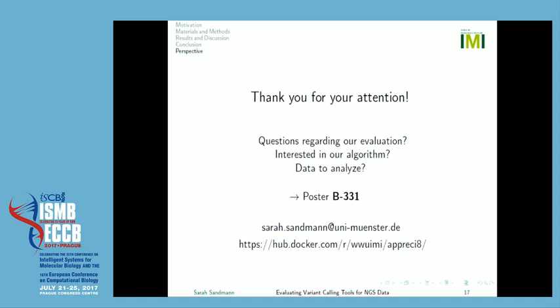Did you observe that? Did that make a difference? Actually, for the tools, we mainly stick to the default options because for all the tools there's such a large list of options, and you could just not change everything to observe all the differences. So we mainly stick to the default options and just to what they recommended to achieve the best sensitivity. We only lowered the allelic frequency threshold and just made it as sensitive as possible. So in the first round, we really tried to call everything possible with the tools, and still some missed quite a few calls. But yeah, that's a good point.